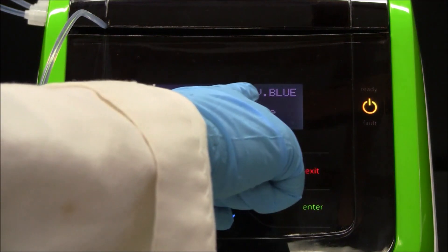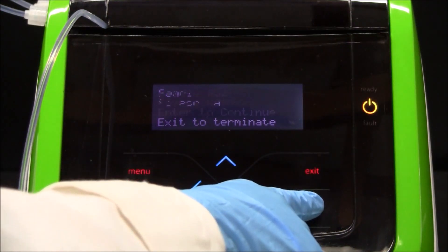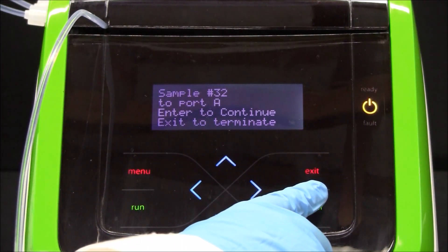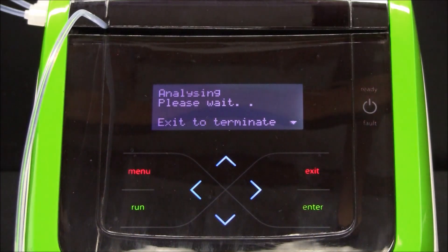Press the run button, then press enter to confirm the correct COD range for your sample. The L100 will now analyze the sample.